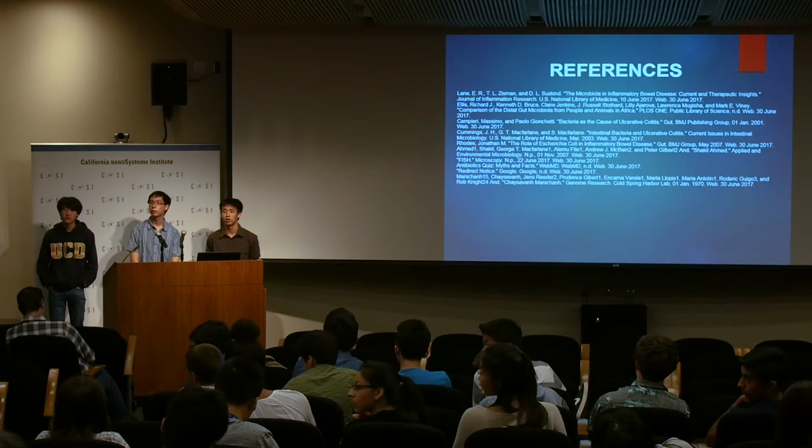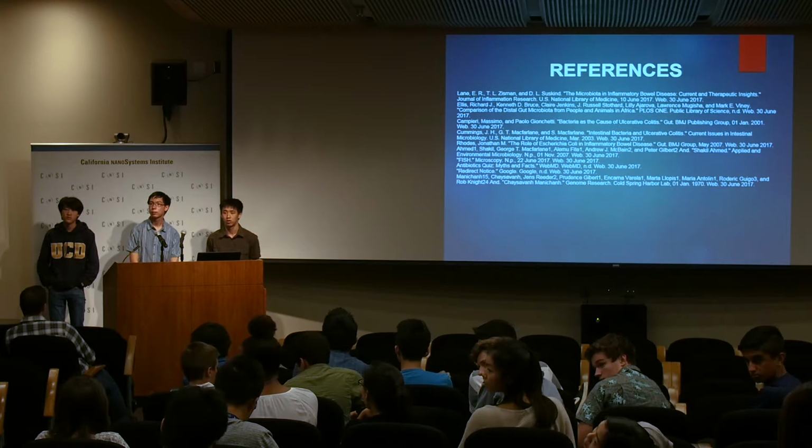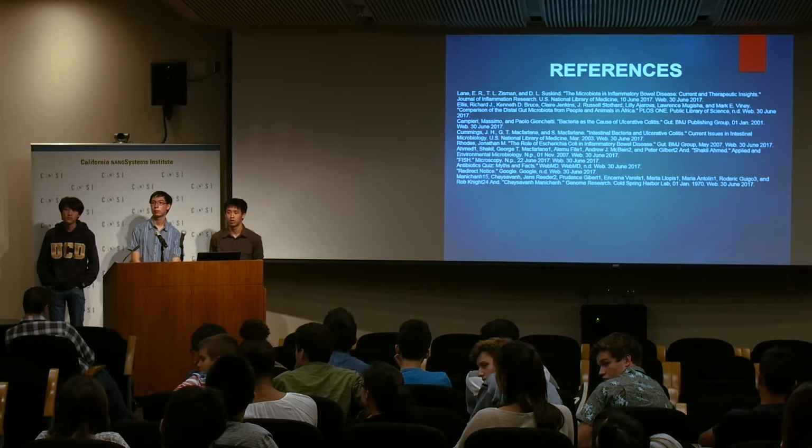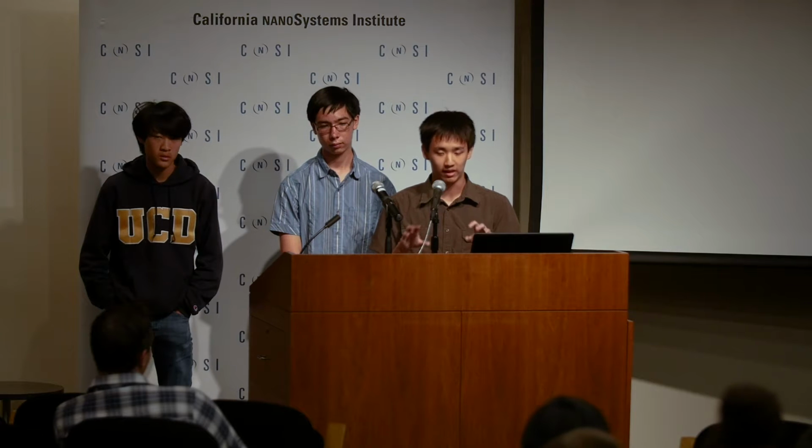If there are over 1,000 different types of bacteria, how do you propose to narrow down that this particular bacteria is the cause for ulcerative colitis? So like the stain that we discussed, the FISH stain, basically we'll have to see, if we ever tried out this experiment, how many different species are within our first sample, and then we'll have to stain them each differently in order to determine how each of them are set apart. That's how we can determine from the T cells which ones are eliminated over time, which colors are noticeably gone because of those bacteria being eliminated first.